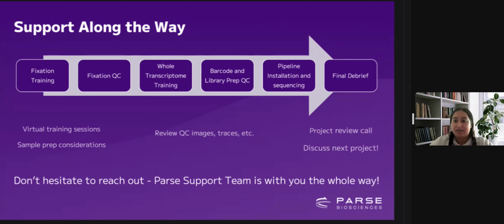We'll then schedule another session. We'll go through the entire whole transcriptome process, like how we barcode and how we do library prep. There'll be some QC metrics for your samples while you're doing that as well. And then when you're ready to send for sequencing and your FASTQ files come back, I'll introduce you to our 2 methods that you can use for analyzing your data.